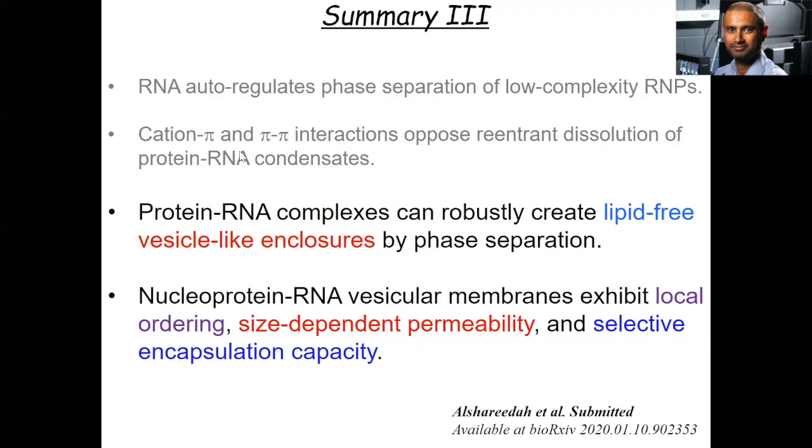It's a competition when two droplets are approaching together, right? It's a competition between the trap trying to keep the droplet and the condensates undergoing fusion due to coalescence, the surface tension and viscosity. So to get a good readout, you need to optimize the system in a way that this handoff is really happening, so that you can see the trap laser signal decaying as this handoff is taking place. And of course, you do that not just standalone, you also do video.